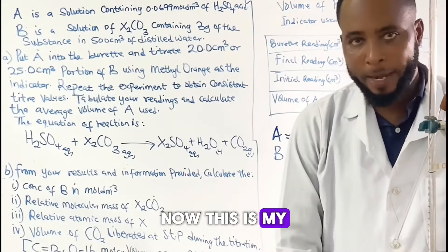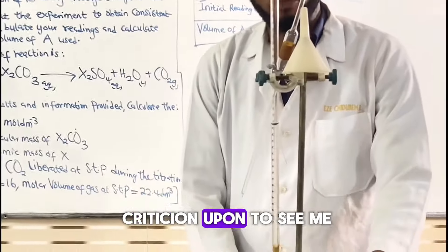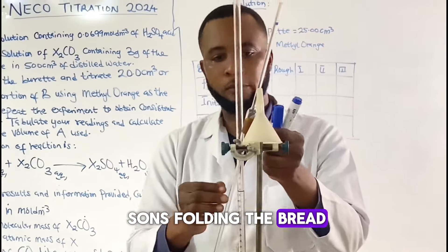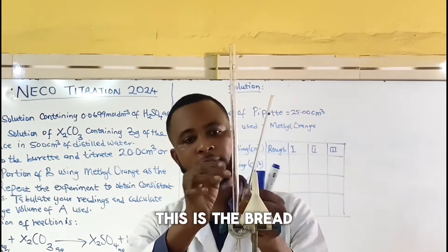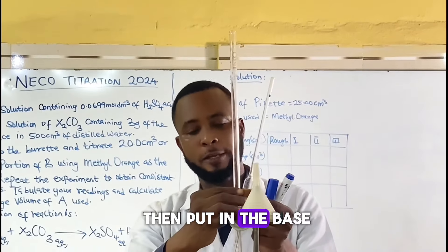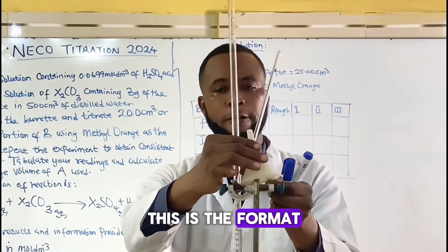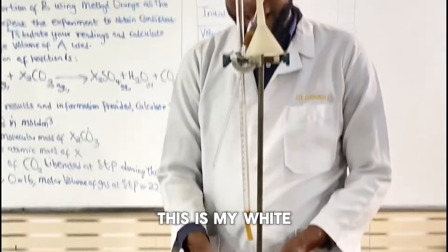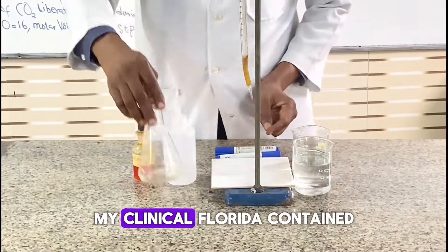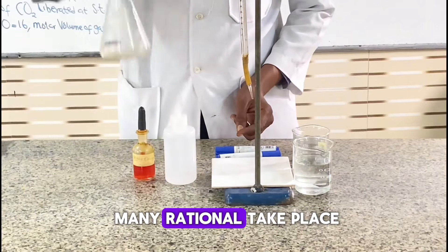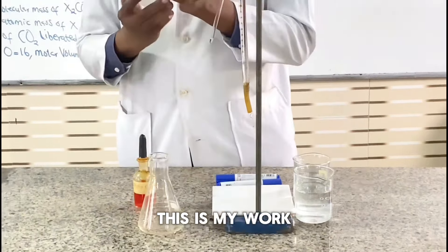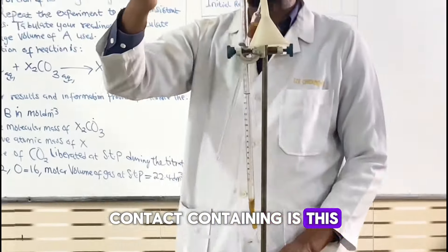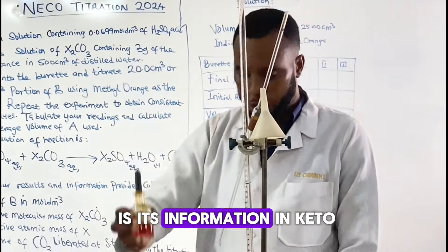This is my titration apparatus. I have the retort stand holding the burette. This is the burette. I have the funnel, which I'll use to transfer the liquids. This is my white tile to indicate the color change. My conical flask is where the reaction will take place. This is my wash bottle that will have the distilled water in it. This is a methyl orange indicator.